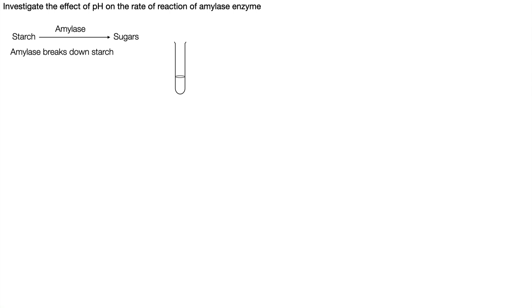Here is a starch solution or starch suspension. We can use iodine solution to test for the presence of starch. So iodine will be orange to start with and it will turn to blue-black when starch is present. So here we can do a little test and we can see it's turned blue-black to show that starch is present.